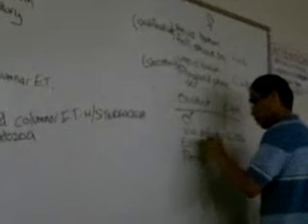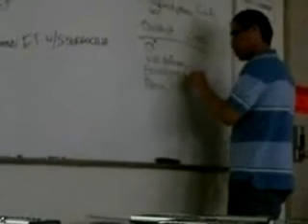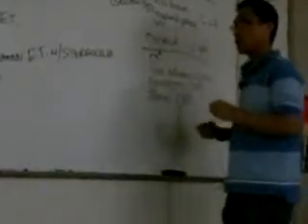Okay, let's look at the epididymis. Do I have epididymis on here? Yes, you do. No, I have rat testes. I forget what I have on the study guide. You have epididymis. Okay, do I have rat testes on the study guide? No. Okay, let's excommunicate that. D-I-D-Y-M-I-S. C-A-R.